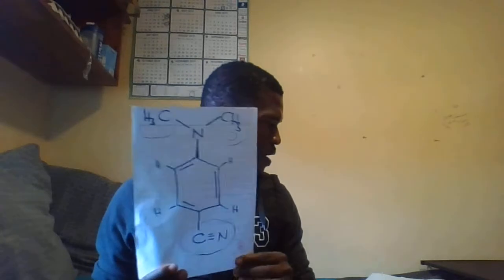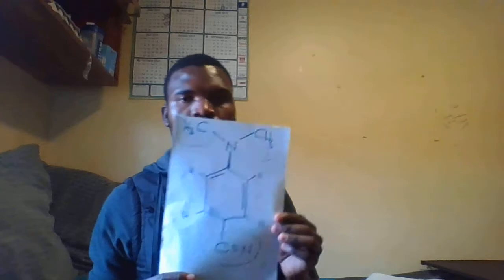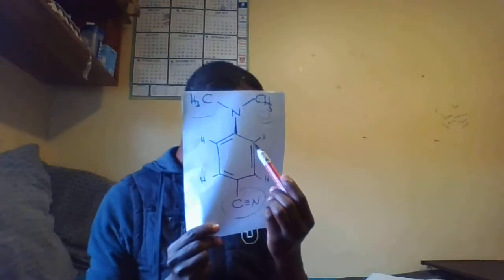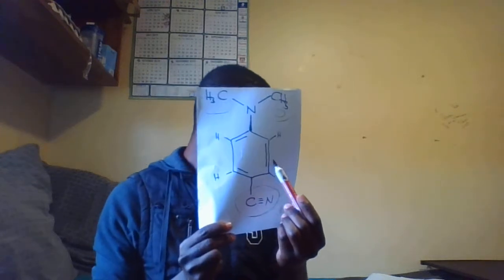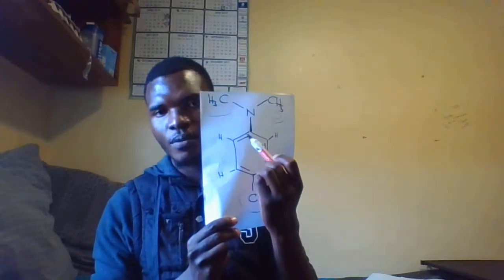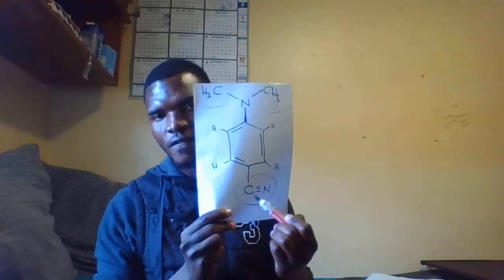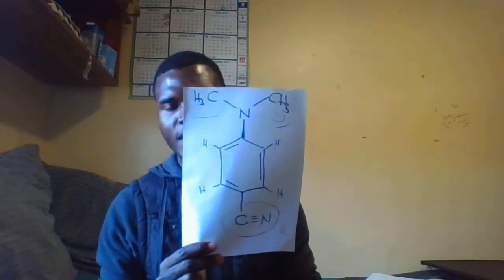Then for a singlet, we have 3 singlets. So we have 2 doublets, 1 quartet, and 3 singlets. So for the singlets, we have this carbon, this carbon, and this carbon, you get those singlet peaks.